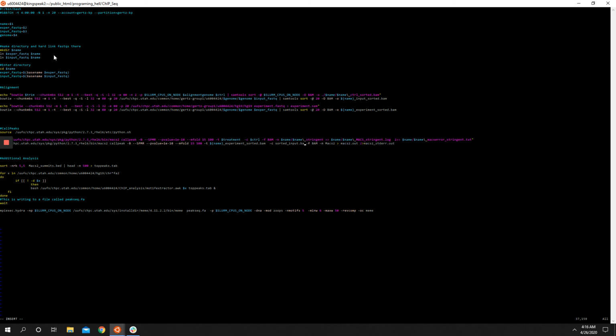And for control, we do $name_input_sorted.bam. Since these are in the folder, we're not going to give them the prefix. I'm not going to worry about that. And then we go down here.